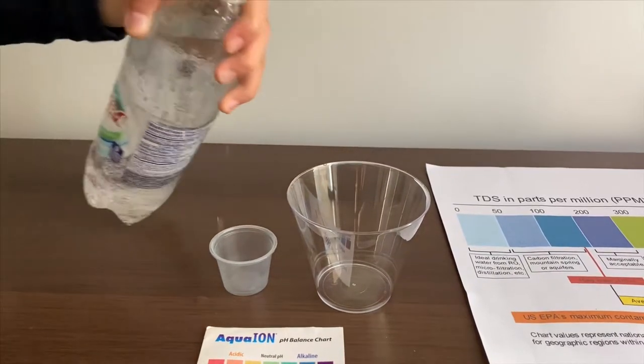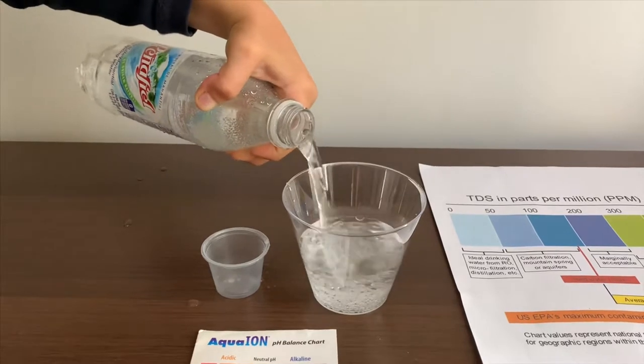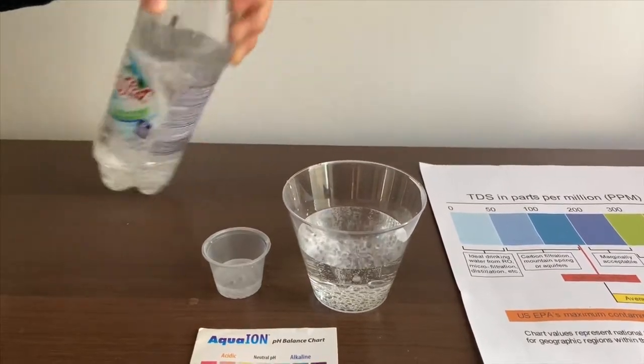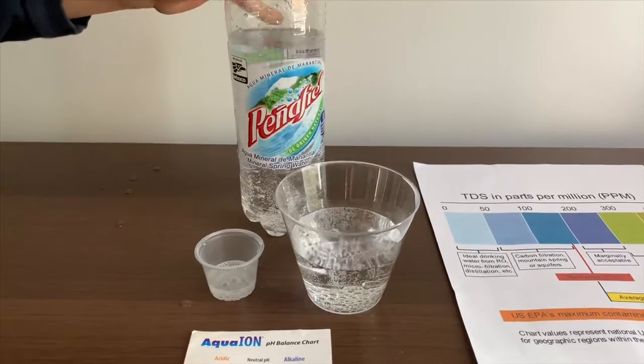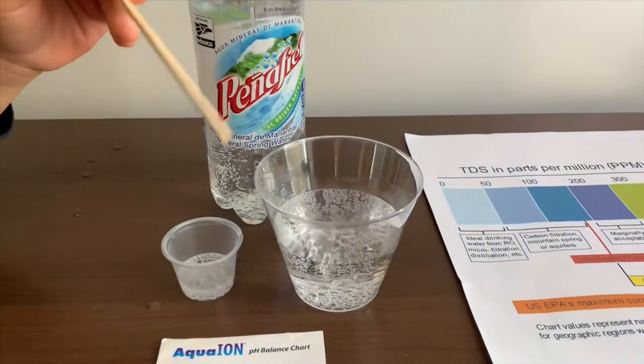Let's pour some water in. First we're going to test the TDS level — let's do it first so we'll get a better result.